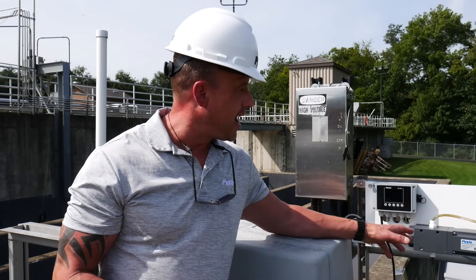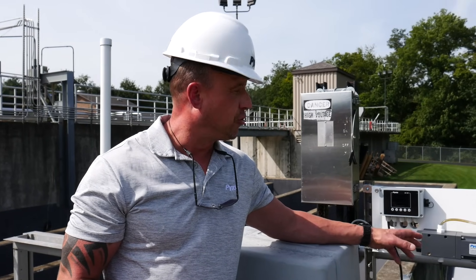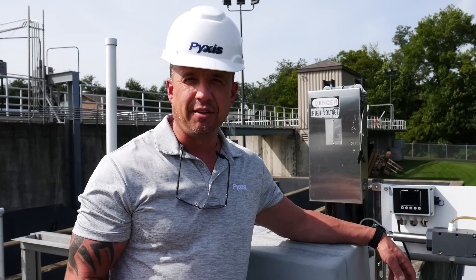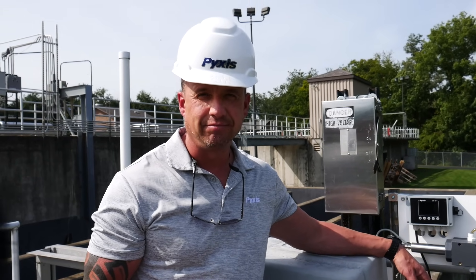Keep an eye out for this new OXIPANEL Industrial Water Application Series. It seems to be capturing a lot of interest, and if you have any questions feel free to reach out to Pyxis at any time. Take care.